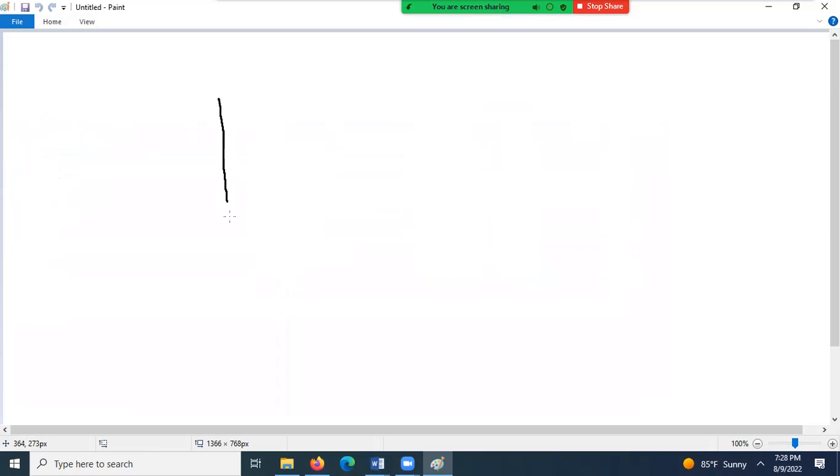So here's our tube. Not a very good tube, but you get a good enough idea. There's our stab mark. It's not very straight, I got it at an angle here, but that's all right. If it grows only in the stab, that's non-motile.